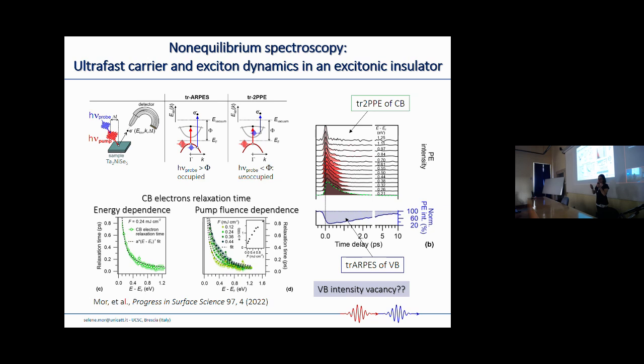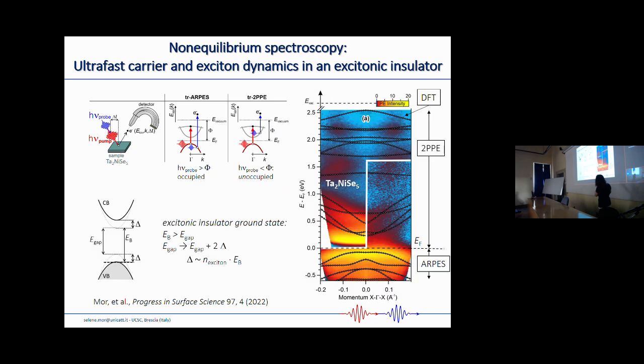So the matrix element has some weight to the intensity, but then you fix that weight and you follow the intensity in time. And here, really in this conduction band bottom, which is the very low part at the bottom of the conduction band, at some point there was no intensity. On the other hand, if you stay here in the valence band, where, by the way, staying at the gamma point, it's really the part this technique is mostly sensitive to, because of energy and momentum conservation and other aspects of the measurement.